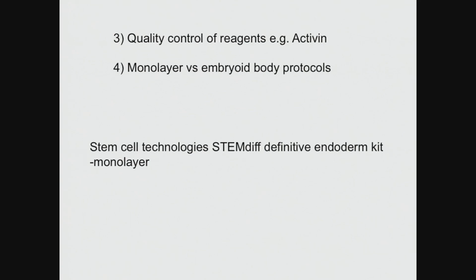I mentioned the quality control of reagents being very important. I mentioned monolayer versus embryoid bodies. And so I've tried all these different protocols, many different iterations, and this is not a commercial plug. Feel free to use whatever protocol you want. We've just found that there's a kit from Stem Cell Technologies, and actually there's a number of different companies now that have these kits. We've just found it works really well and easily. It is expensive, but we've also figured out ways to get the most out of it in terms of you can actually start with just one well and do a full differentiation that ends up with many, many wells. But it's expensive. Hopefully it gets cheaper.